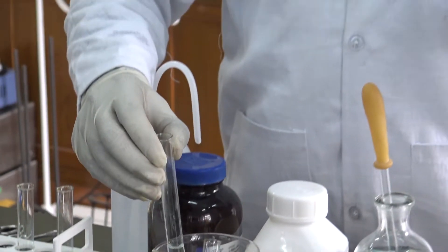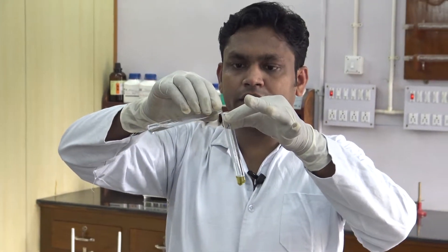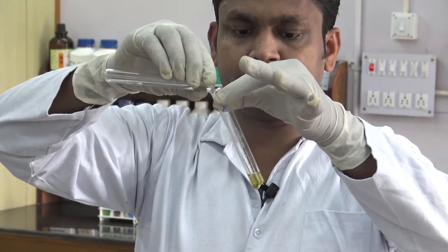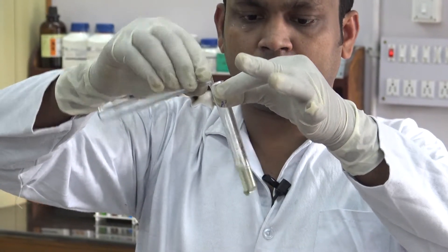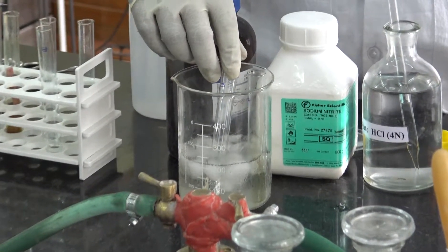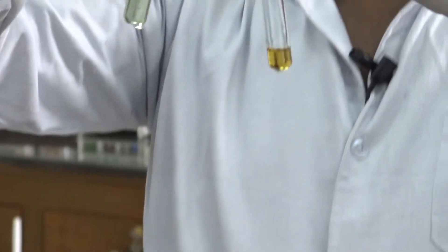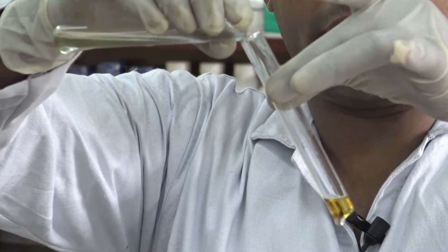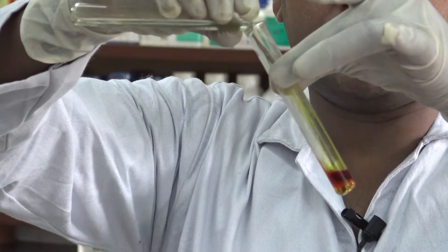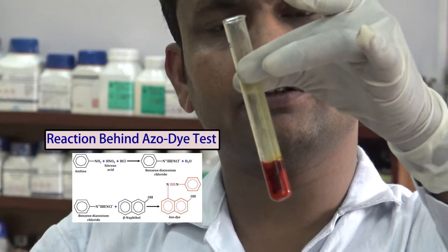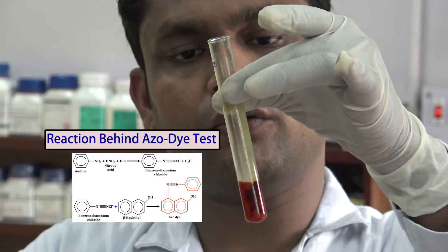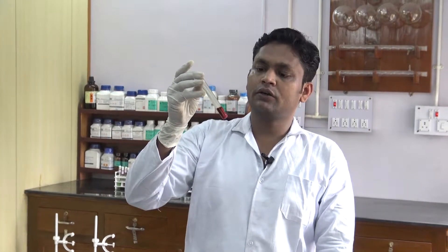After cooling, the solution from test tube B containing NaNO2 is poured into the acidic solution of the sample in test tube A. The solution is again cooled. Then the combined mixture is poured into the alkaline beta-naphthol solution in test tube C. Formation of a brilliant red coloration confirms the presence of aromatic amine in the given organic sample. Note that if the temperature exceeds 10 degrees centigrade, the dye formed can be charred and will not produce a brilliant red colour, so cool the reaction mixture properly in the ice bath.